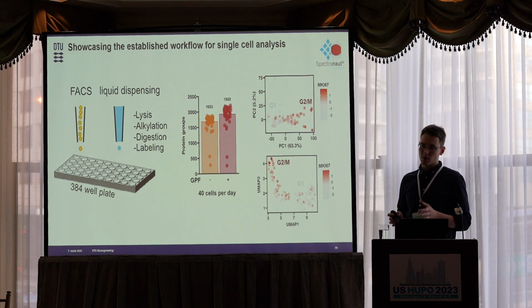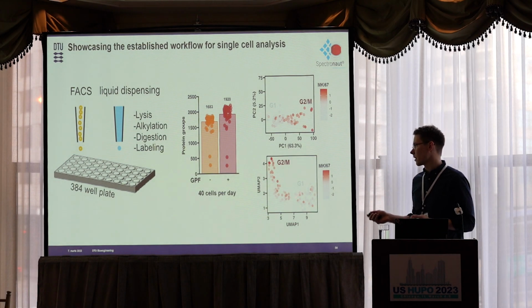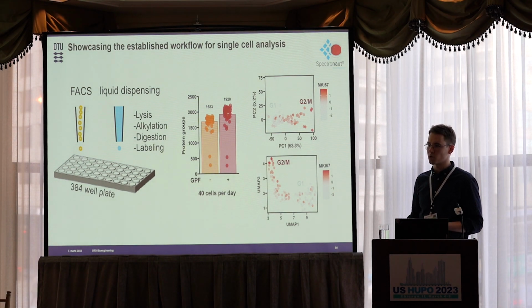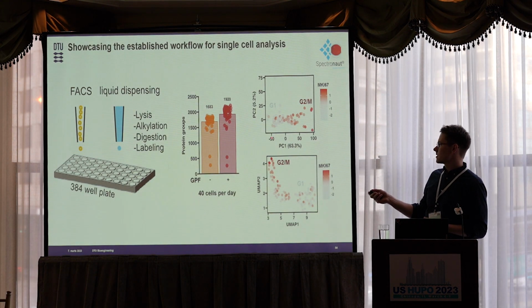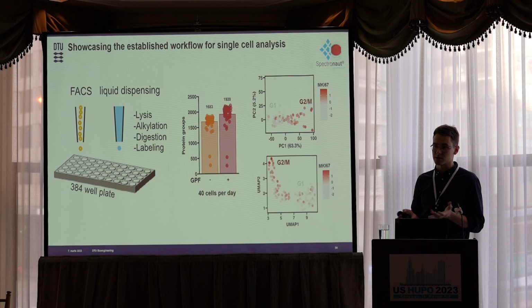Then we want to gauge, are we actually capturing any biological variation in this data set? So we use two methods to cluster it: the parametric method PCA and non-parametric UMAP, the most popular approaches you see. For my PhD, I really like this one protein called MKI67, which is a G2M marker. It's highly expressed in late G2M cells. If we look at PC1, we can see that the color gradient nicely follows the MKI67 expression. We're capturing a large degree of variation in that principal component, like 63%. That makes a lot of sense because the only major biological variation in the system is the cell cycle.